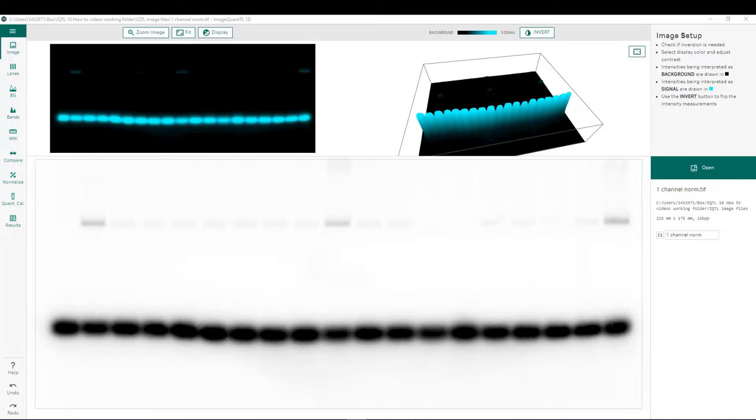Specifically, we will be looking at an overview of the steps prior to normalization, choosing a reference band for normalization, choosing a reference value for the chosen reference band, and finally exporting our results to Excel.